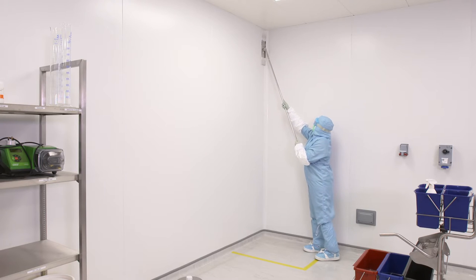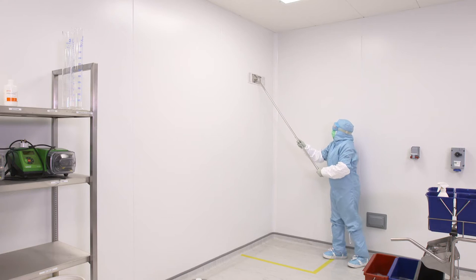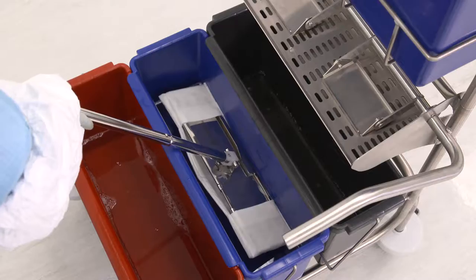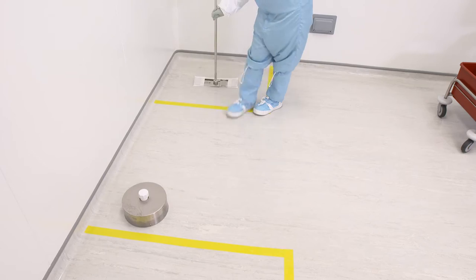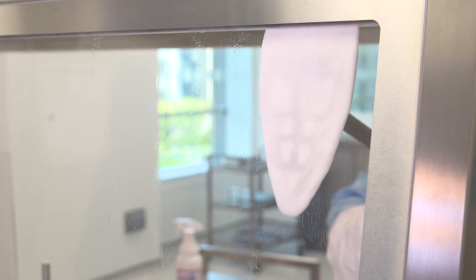But it's a complex and physically demanding process which requires well-trained operators. These operatives must focus on the details of validated methods to achieve complete surface disinfection, maintaining complete control of the clean room environment.